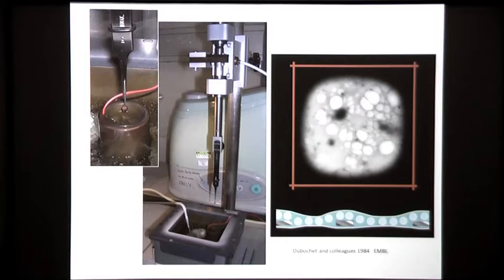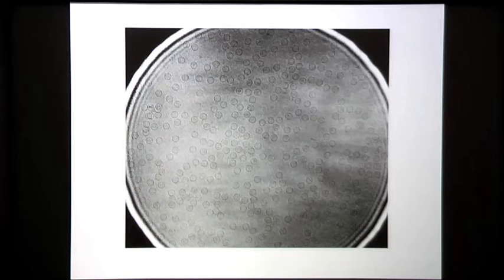They're in solid water, and you mustn't then let the ice warm up, the grid warm up, because then the glass-like structure will turn to crystalline ice, and that will damage your specimen. So you end up with a grid something like this, with the virus particles, or whatever your particles are, suspended over holes in the carbon film and embedded like this in a thin film of water. And from that, you can take images like this.